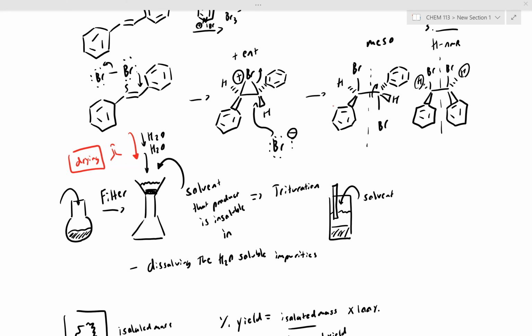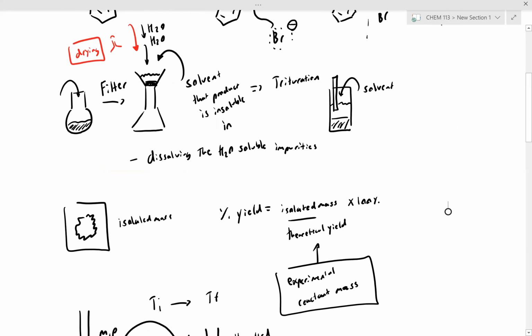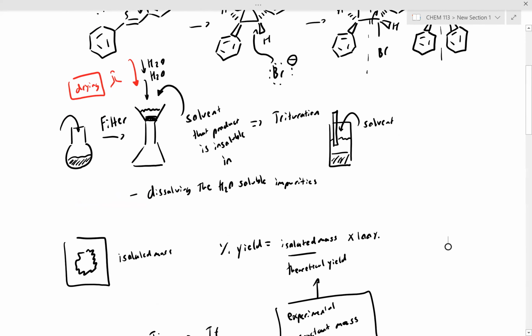Oh, sorry. Okay, so continuing on, after rinsing with water or triturating our solid with water to remove the soluble impurities, we're going to be adding acetone as a drying agent. One little issue with acetone is that our product is slightly soluble in acetone, so we have to rinse with cold acetone, and even then we lose a little bit of product during this drying step. Just something to note. There may be alternative methods to dry a sample, and you can refer to alternative techniques found in your lab manual.